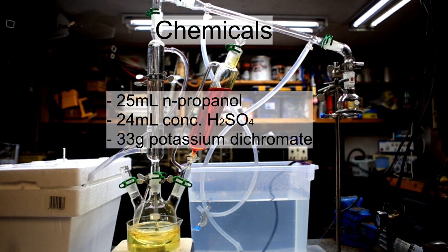For this experiment I used 25 milliliters of n-propanol, 33 grams of potassium dichromate, 24 milliliters of concentrated sulfuric acid, and 200 milliliters of distilled water.